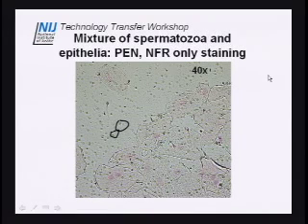Now, that's something that can be seen as a disadvantage, because you see here's a sperm cell head with a tail, and it's not much bigger than these pores. So that was one thing at first when we were using these slides and using the Leica microscope. It could be hard, especially when using a lower objective, to really identify those sperm.